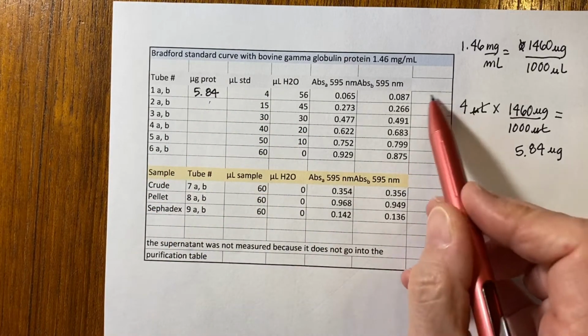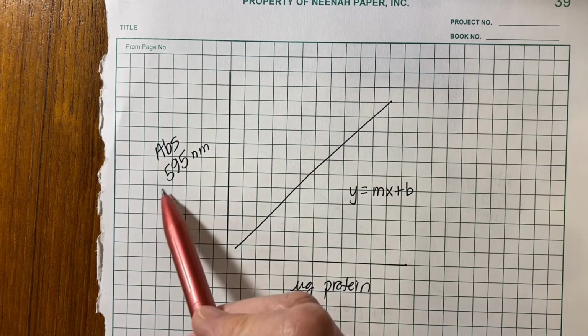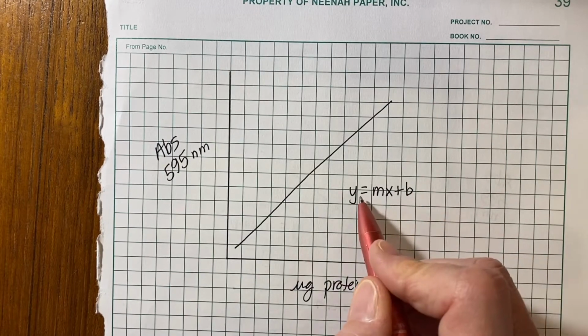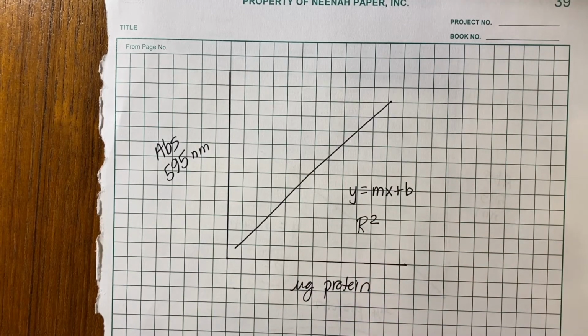The average absorbance is your Y value, and then you would make a standard curve plot like you've done before. 595 on the Y, micrograms of protein on the X. You'll get a positive slope. Write down the y equals mx plus b equation, or do a linear trendline, and also get your R squared value.